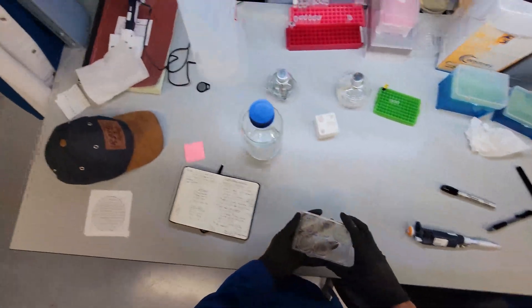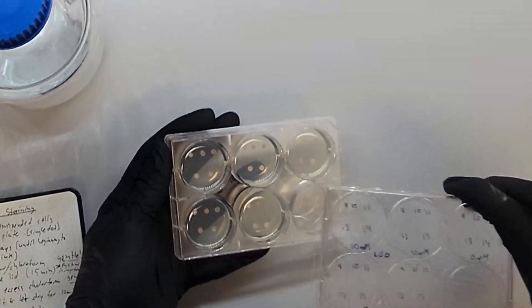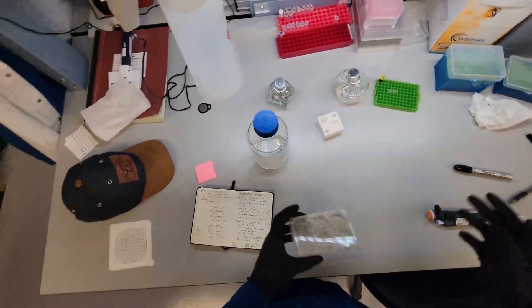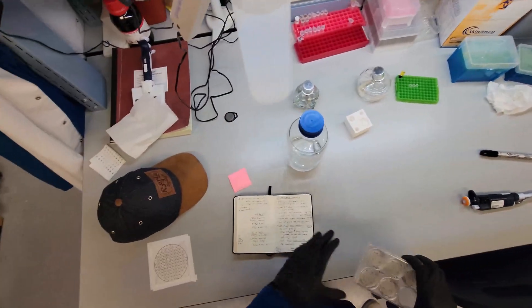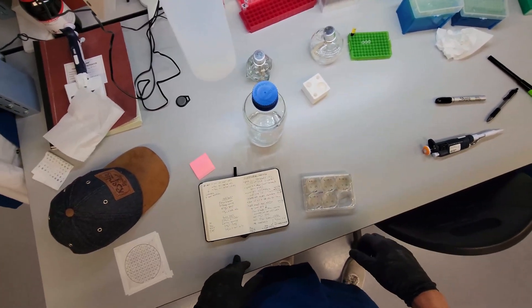So these are the cells here. This does say LSD. So those are the colonies there. They've grown two days. You can use beta-galactosidase staining for a lot of things. I'm not going to go into the details of this project. If you have questions, you can leave them in the comments below.